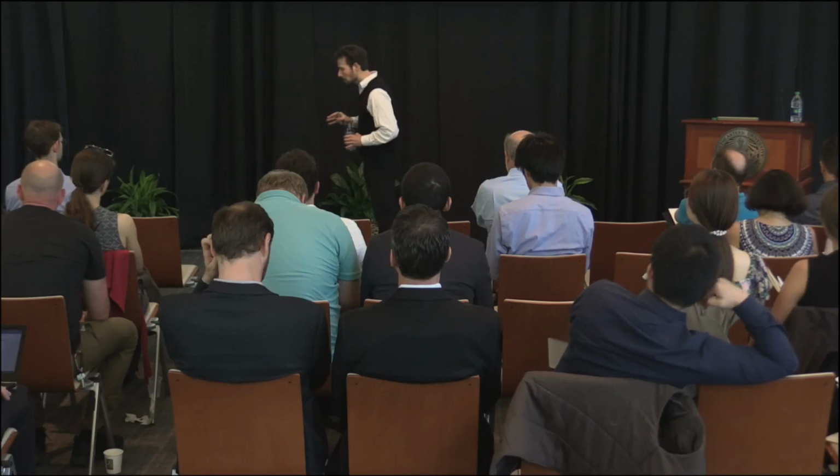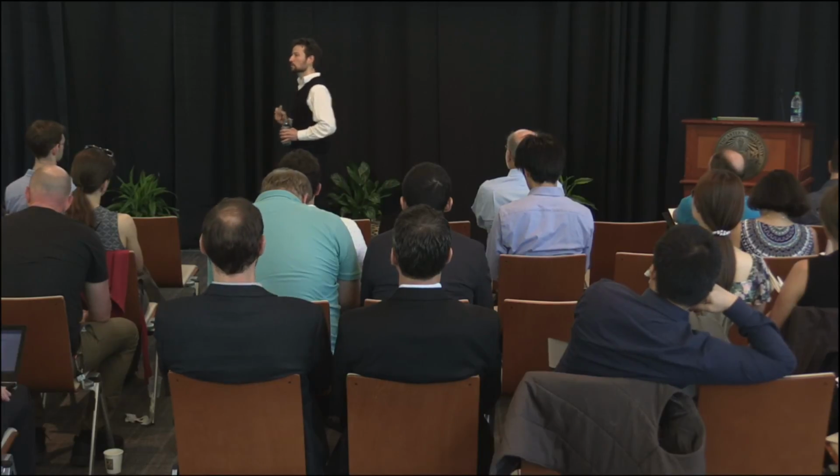So with the sequence identification, the only thing that I'm going to say at this point is that I think using the retention time information is a major avenue that can help. But I like very much some existing approaches, such as match between the runs. But I would like to have estimated confidence in addition.